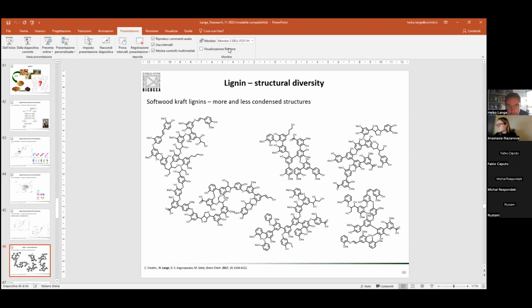So I think dialysis packs can be quite pricey. I might be wrong here, but generally, what method would be your go-to for lignin fractionation? Well, the easiest thing to start with is probably choosing a standard set of solvents that have different polarities, in order to play with the Hansen solubility parameters, basically.